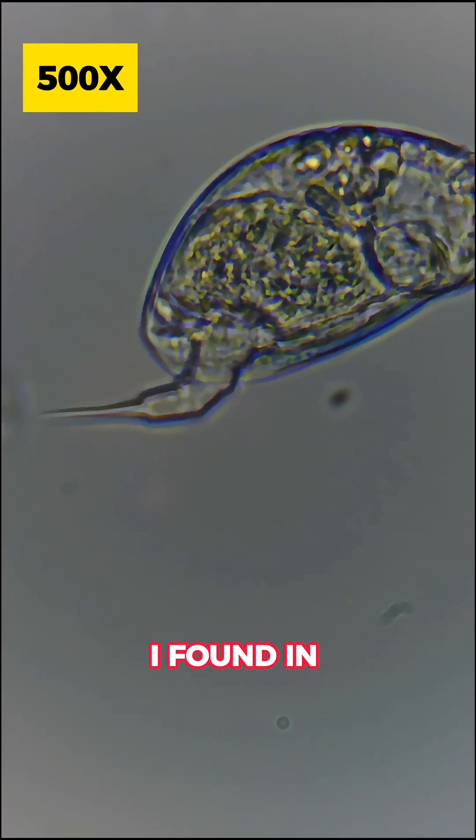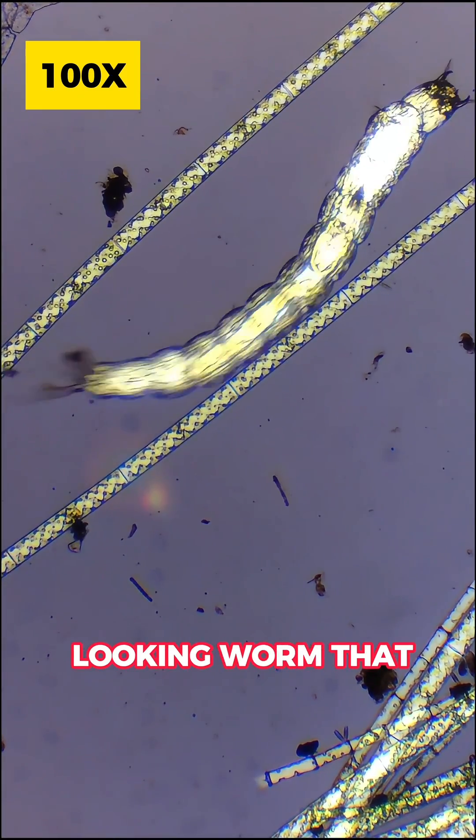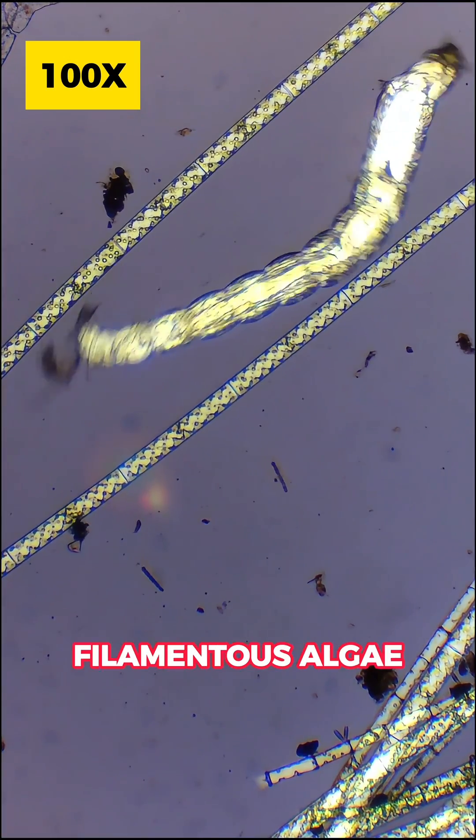Here's another rotifer that I found in the sample at 500x magnification. I also found this nasty looking worm that was stuck in between two filaments of algae.